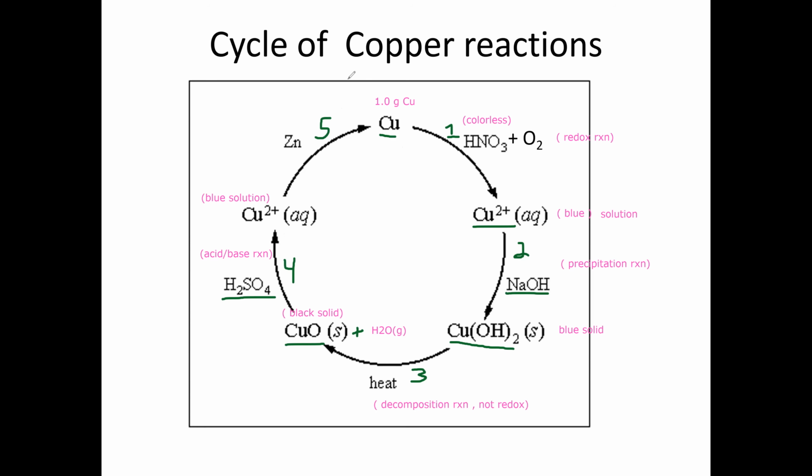And remember, copper is an orange solid. Now, what you'll also notice is that the solution will be colorless because zinc 2 plus solution is colorless. So this is a single replacement reaction. I've written here the types of reactions in each step and what you should be observing.